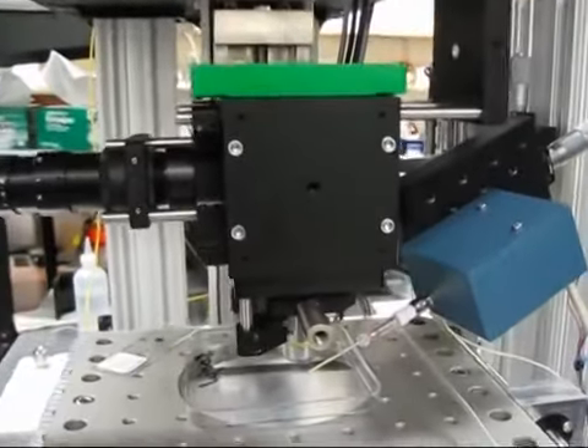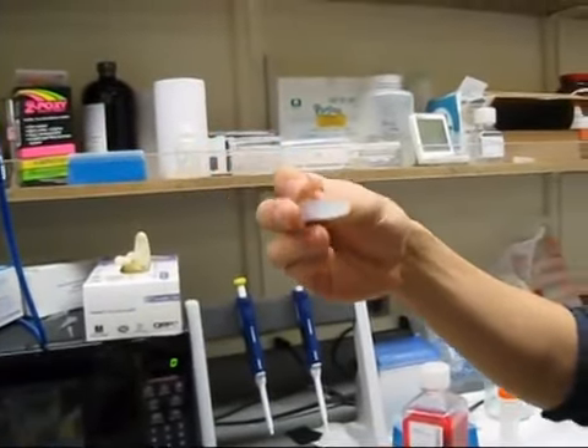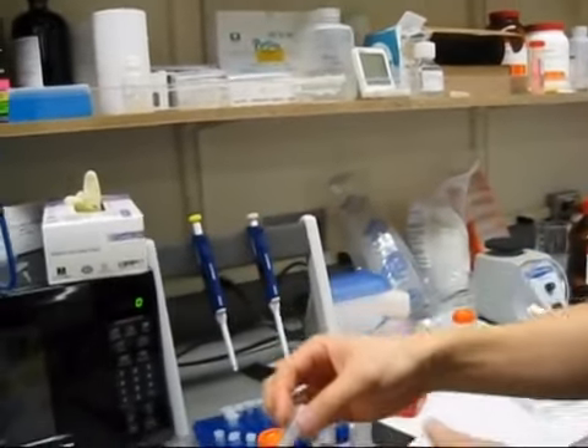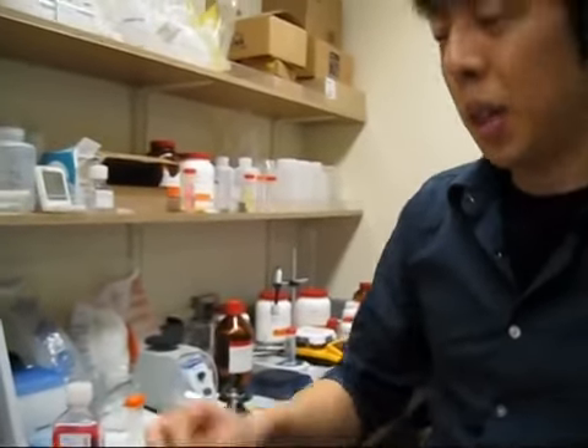In this case we're looking at zebrafish — a small fish. We have a cross-linked polymer, it's like Jell-O basically. When this is melted, we put the fish inside the droplet and then cool it down. The fish will be alive for several days, and you can image the brain activity in the fish.